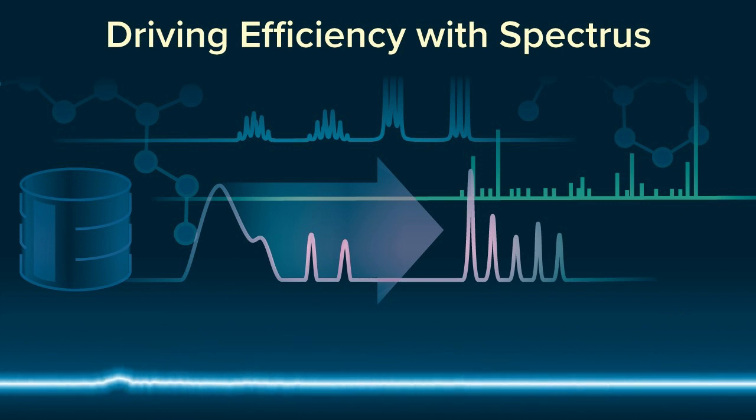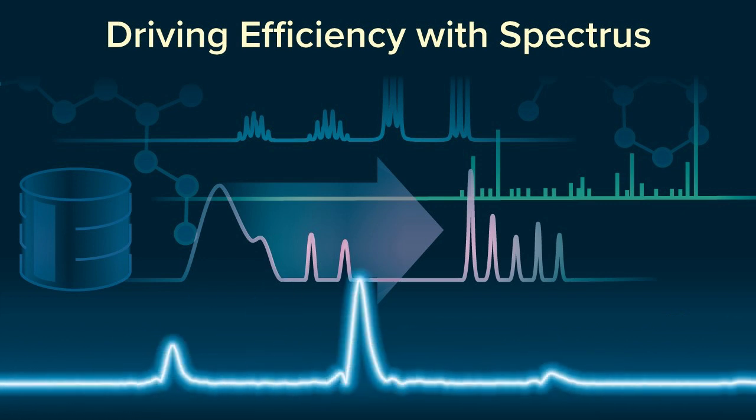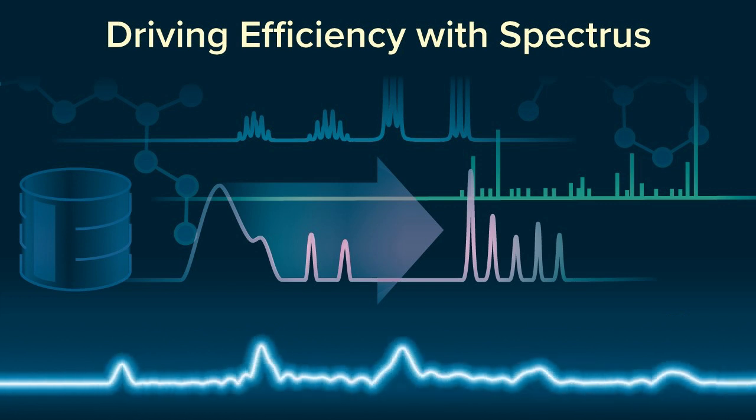We closed the symposium with Tatiana Didenko, a principal scientist at Amgen in the lead discovery and characterization group. The group performs structure elucidation of molecules both large and small by NMR, and she talked about their high-throughput NMR workflow for the small molecules. I'm familiar with high-throughput experimentation, but what does that look like for NMR?